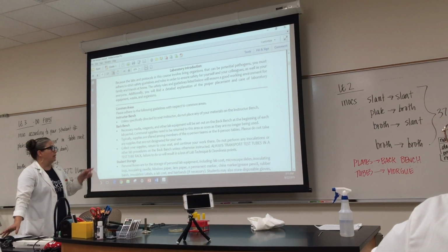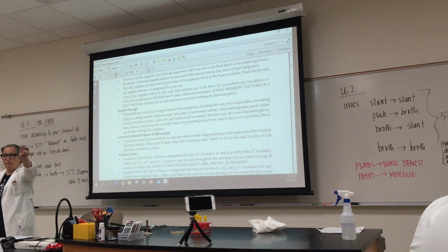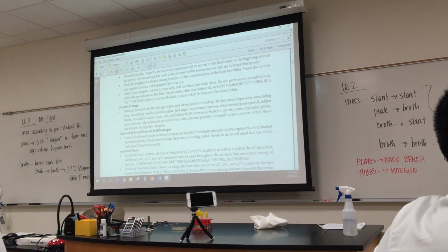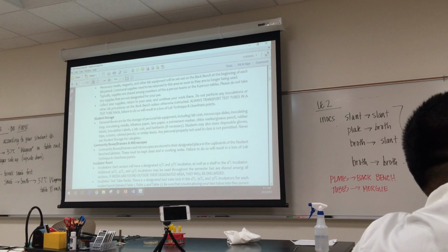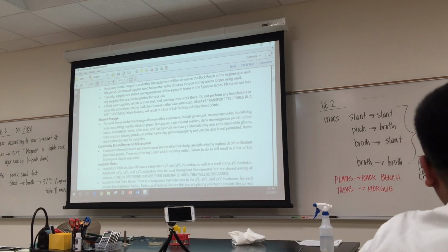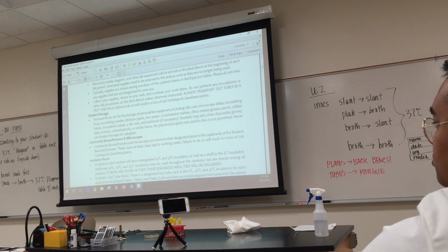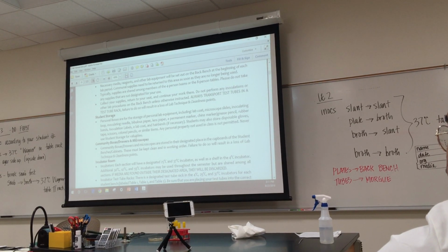Student storage, right? You're already kind of getting used to that. That's your personal box. Personal box will remain there. Please don't put your name on it. Just use the box that corresponds to your number. And that's really helpful for us, because if you accidentally put a communal supply in your personal box, like let's say you open up your stuff and you're like, oh, my striker's gone. And so I look and I go, okay, you're number 17, Tuesday, Thursday, AM 17, I'm going to check their box and see if they accidentally put the striker there. So that's why we do it by where you sit. You don't go into other people's personal boxes. You will let me know if something's missing, and I will go and look for it.